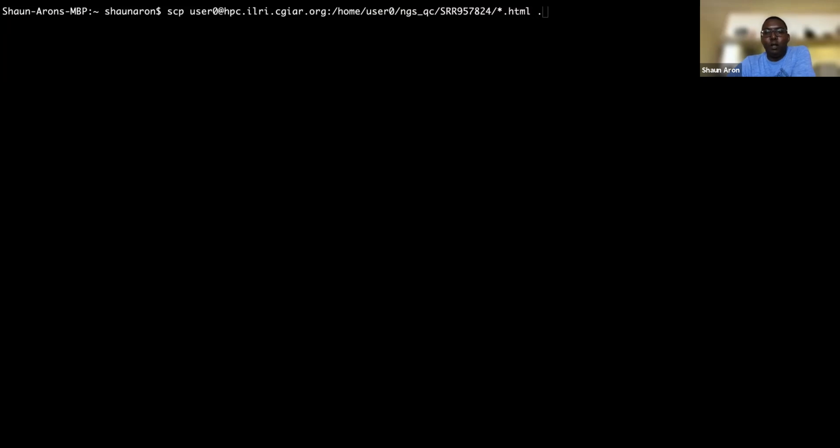So yes, Winnie, you can run. So I've given you two sets of files. There's two zips directories. For the first part, for this practical, I just want you to run it on the first file. So SRR957824, the two files.